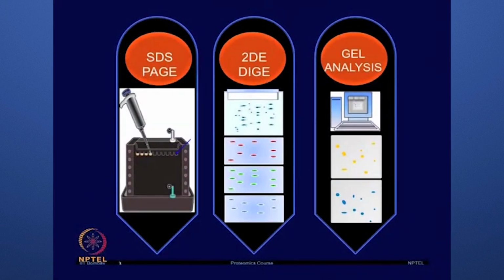So, today we will discuss two papers where authors have applied differential proteomic analysis using two-dimensional electrophoresis. Before I discuss the applications, let us refresh whatever we have discussed in the previous lectures on various gel-based proteomic techniques.